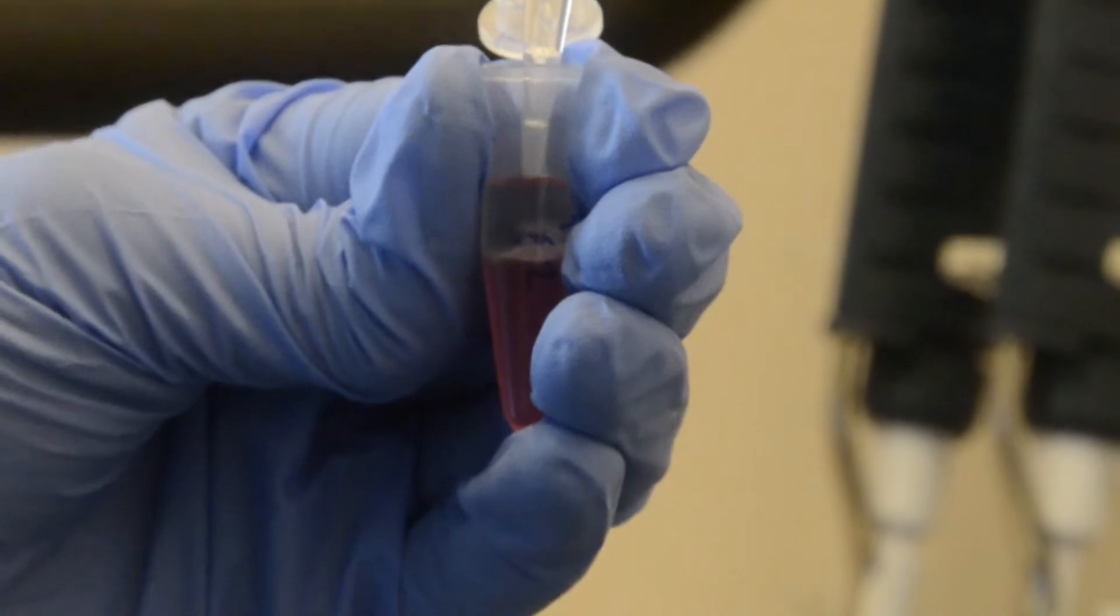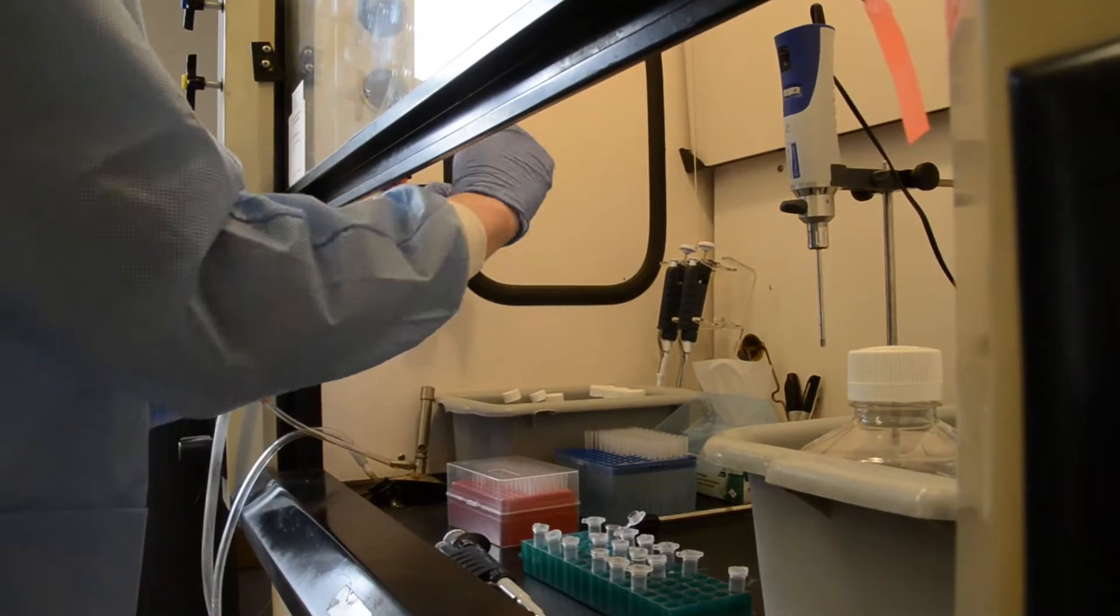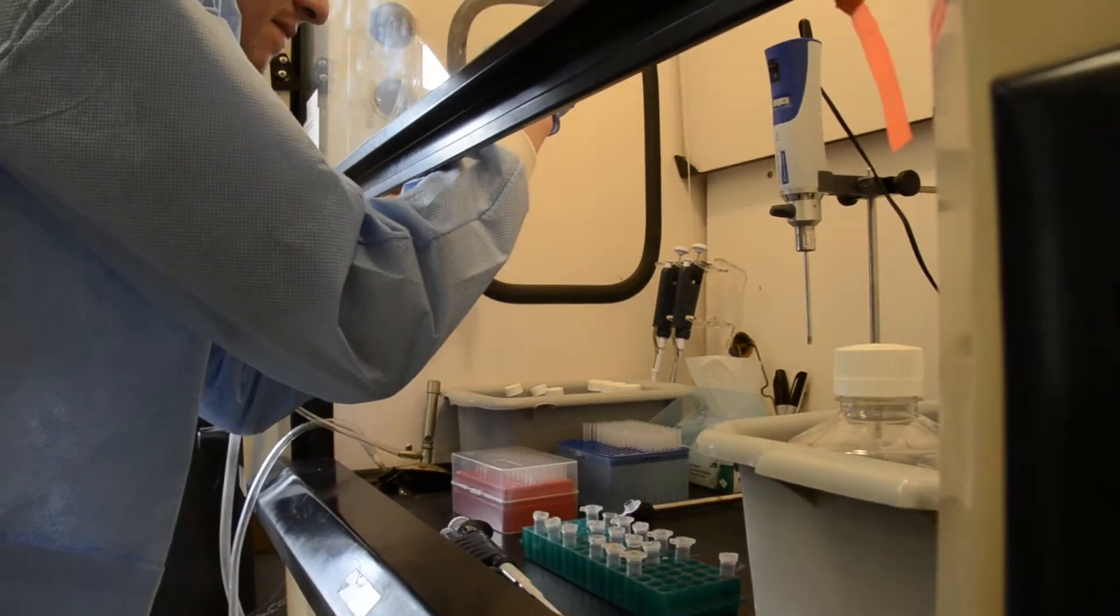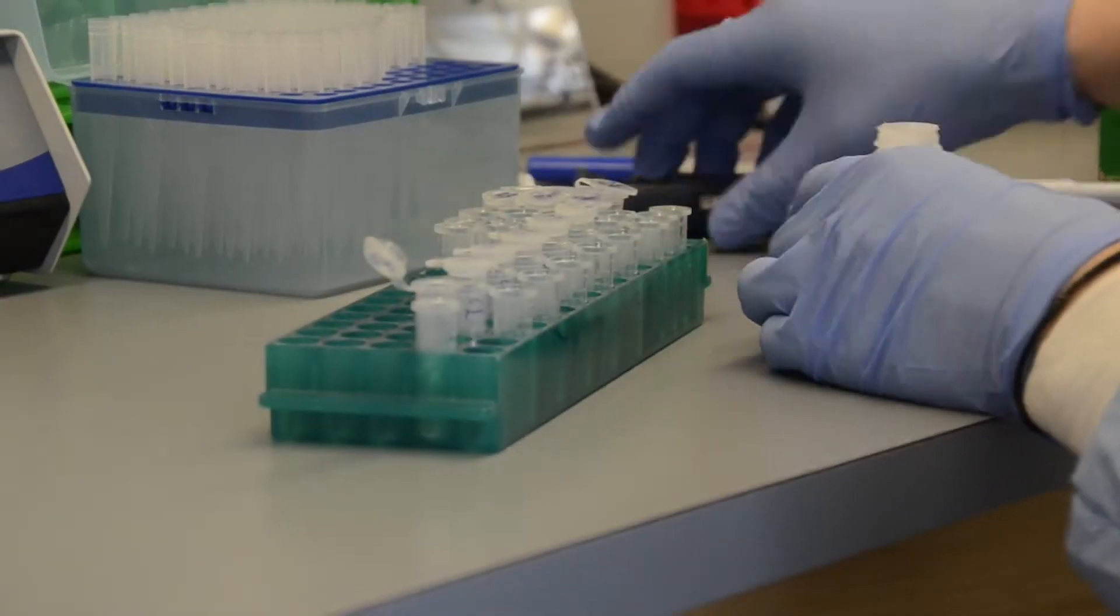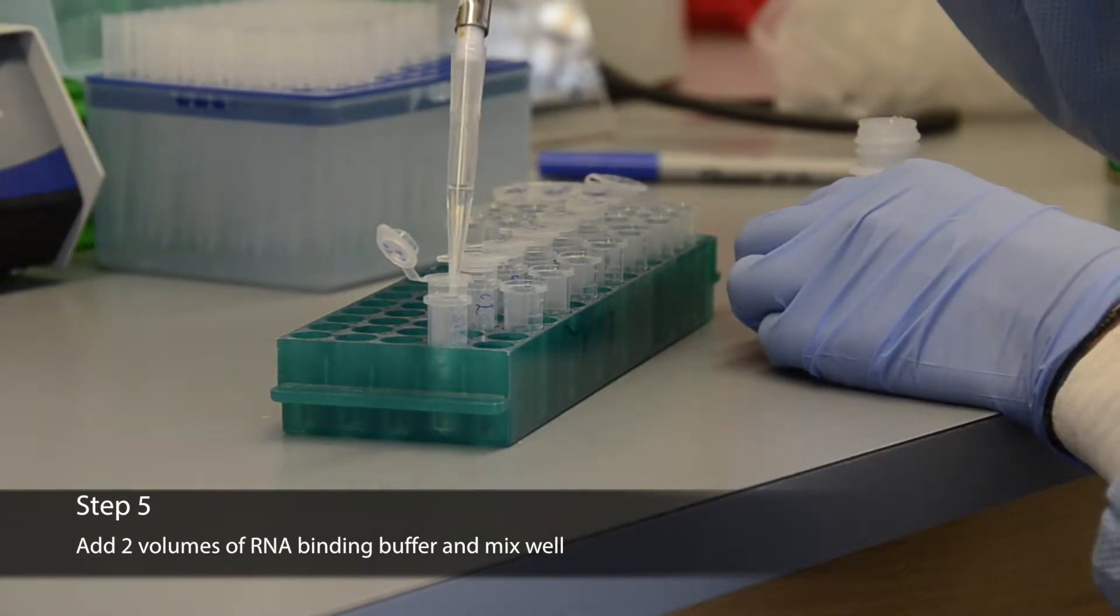If you puncture the phenol layer, re-centrifuge samples as previously described. Add two volumes of RNA binding buffer and mix well. Avoid vortexing.